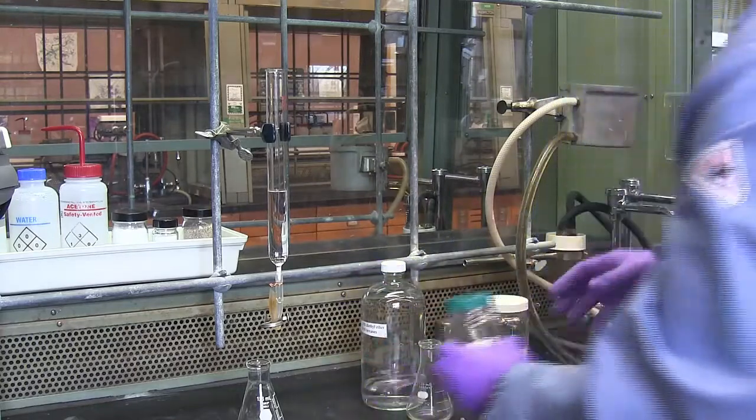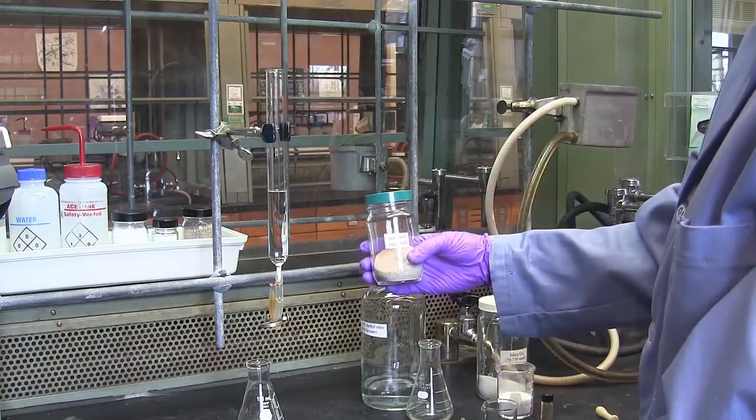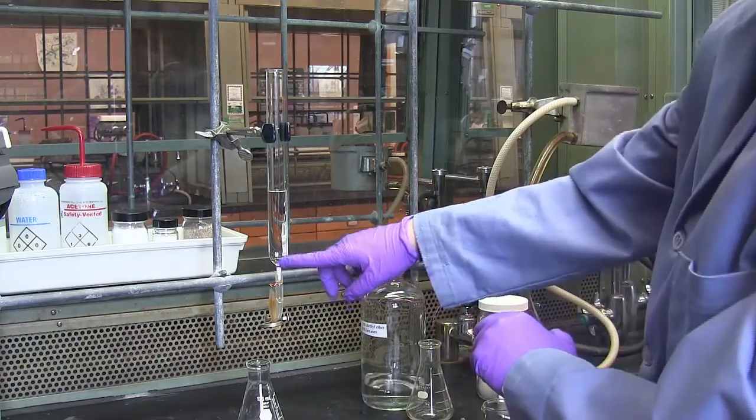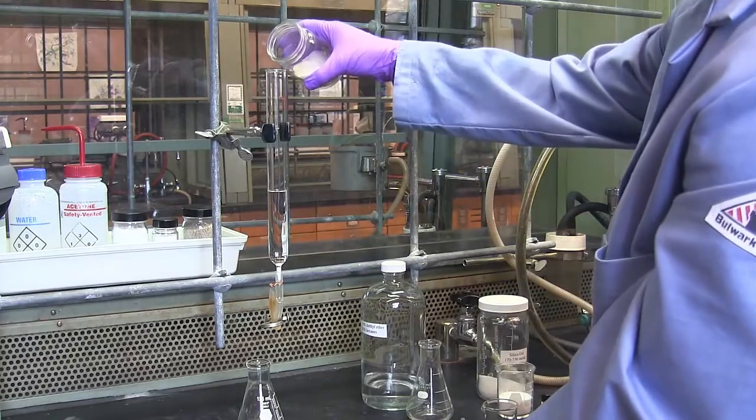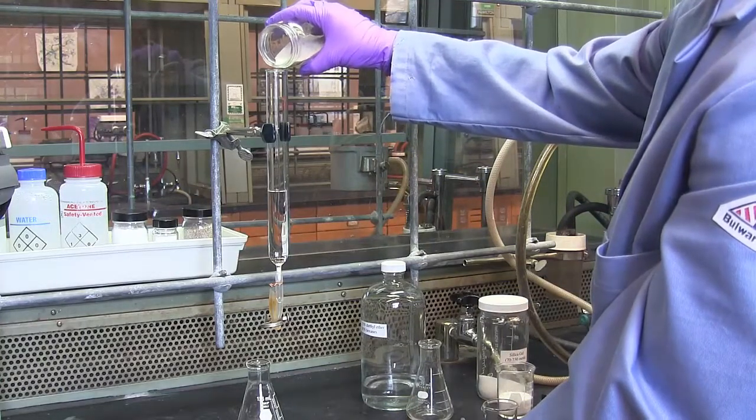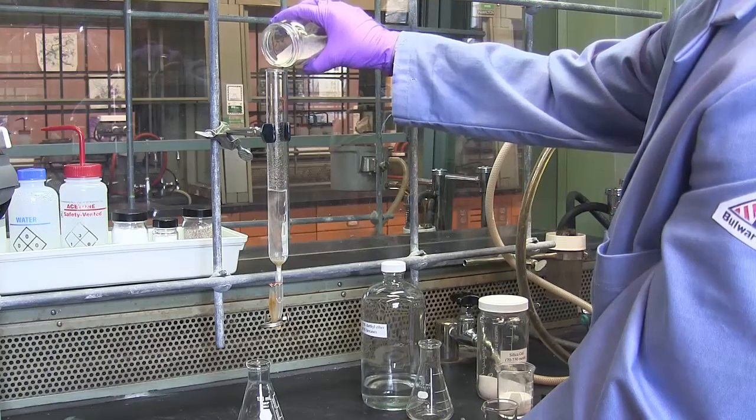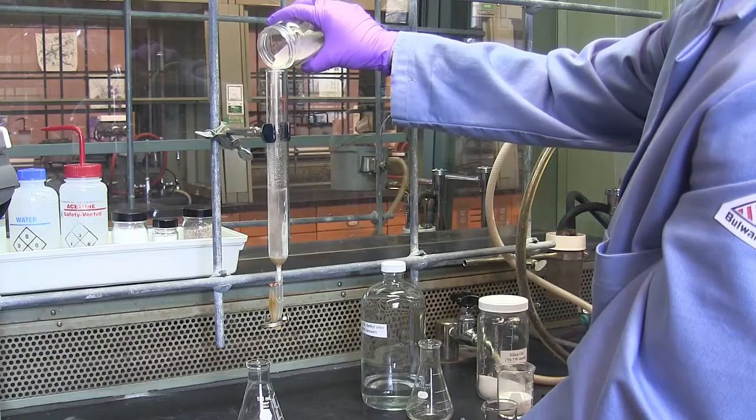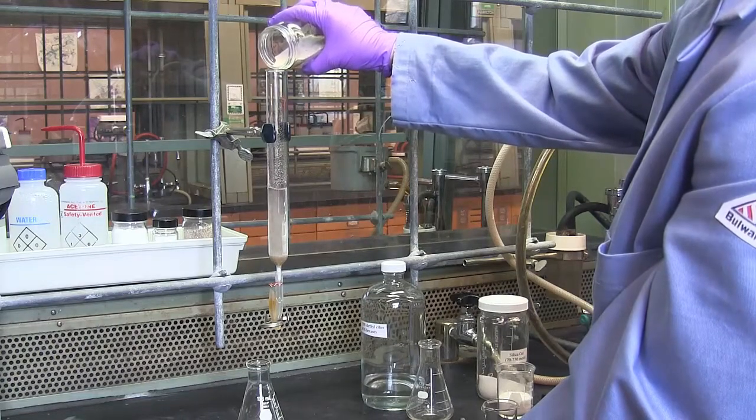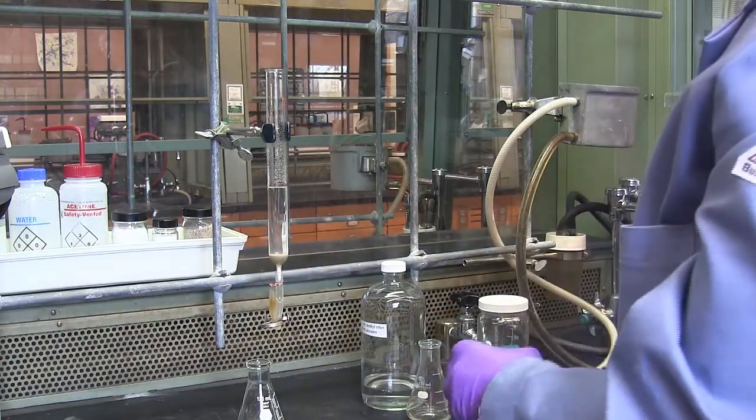And then to create an even bottom on the column, I want to add sea sand to the column just over the curved portion of the column. You do not want to use the playground sand that's in the back of your hoods. You want to use nice, clean sea sand. So I'll add it to about a 1 cm or so depth, just to clear the curved portion of the column.